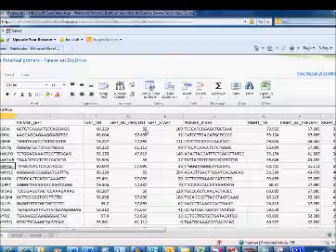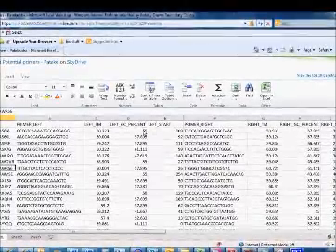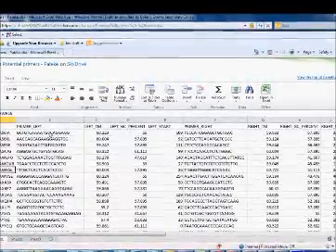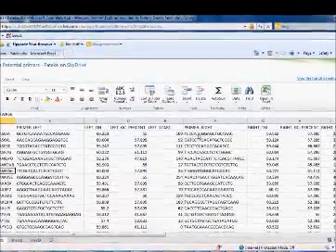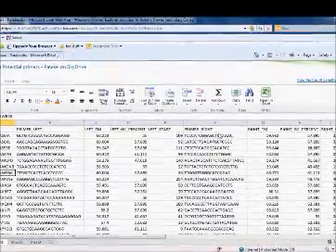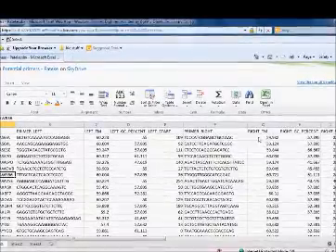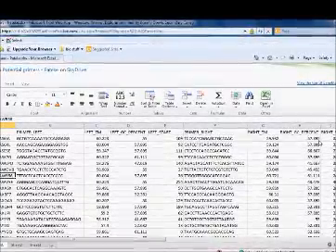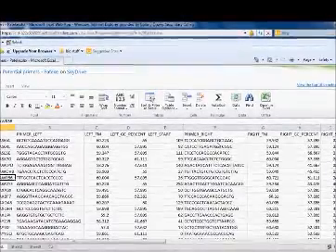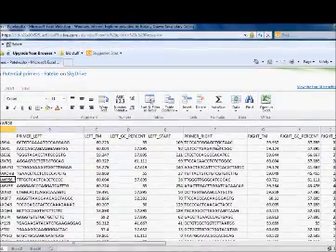We can also find out that it's got a GC percentage. We'll talk about that again in a little while. That's the 55% of this primer made up of G's or C's. We don't need to worry about the left start and the right start. But here we've got the same thing for the other primer involved in this microsatellite, with again the TM and the GC percentage. That's going to be really important when we're trying to narrow this list down to just the primers that are going to be useful for our profiling.